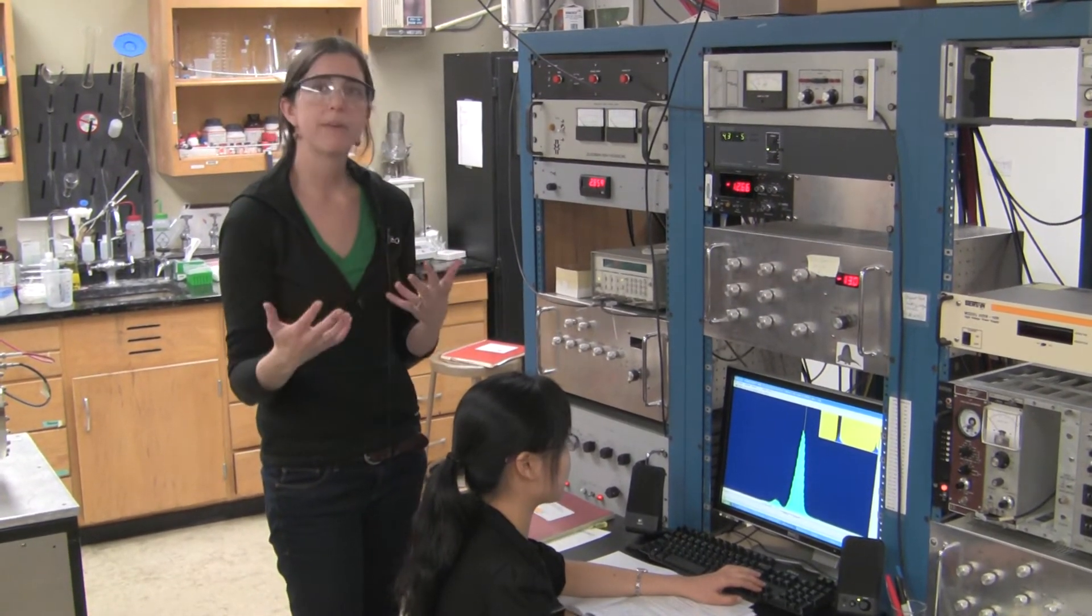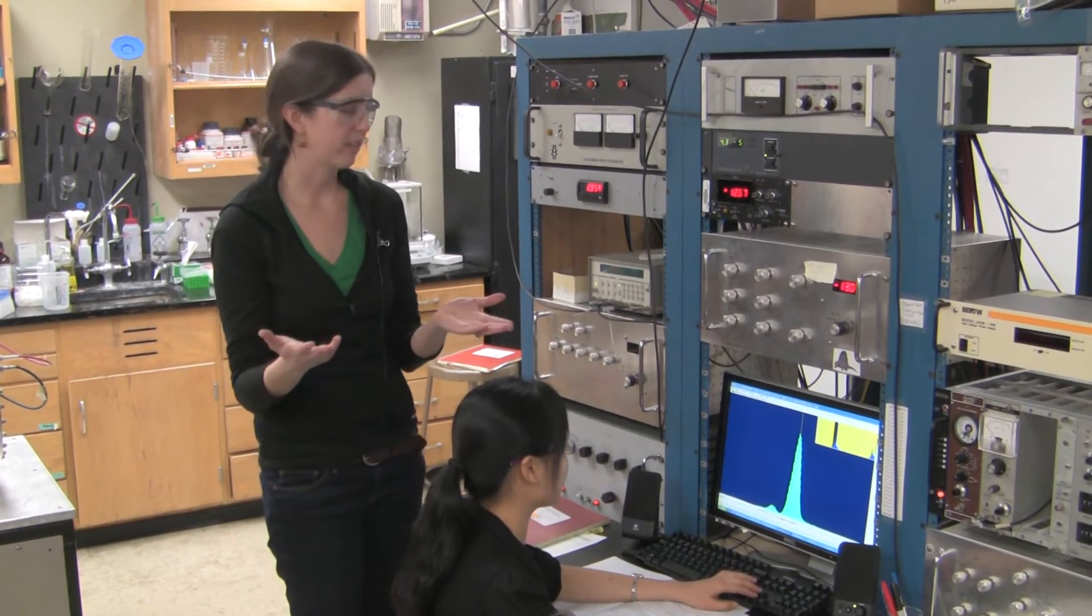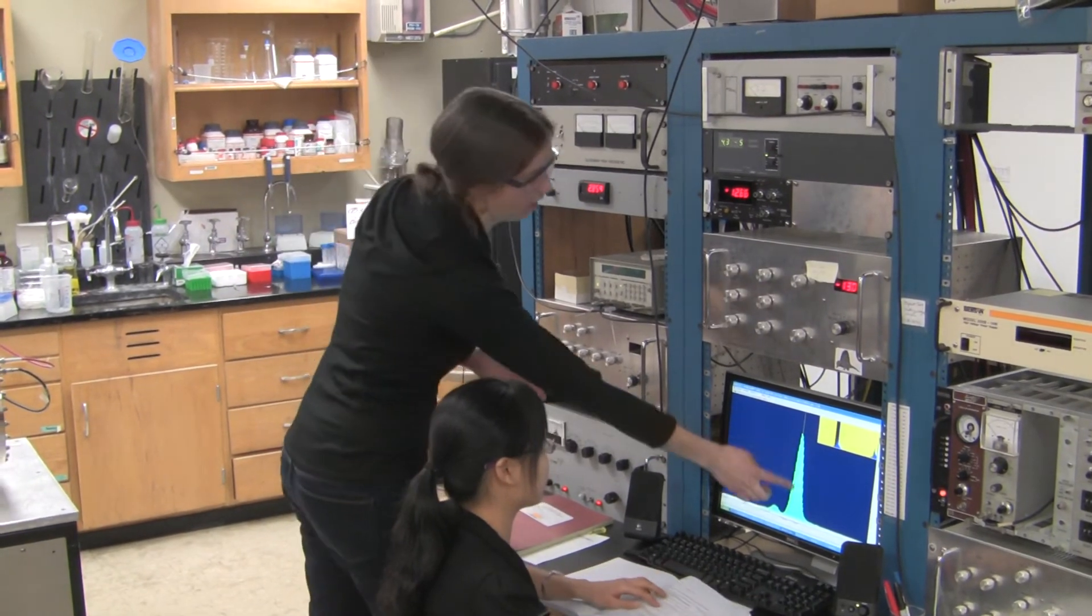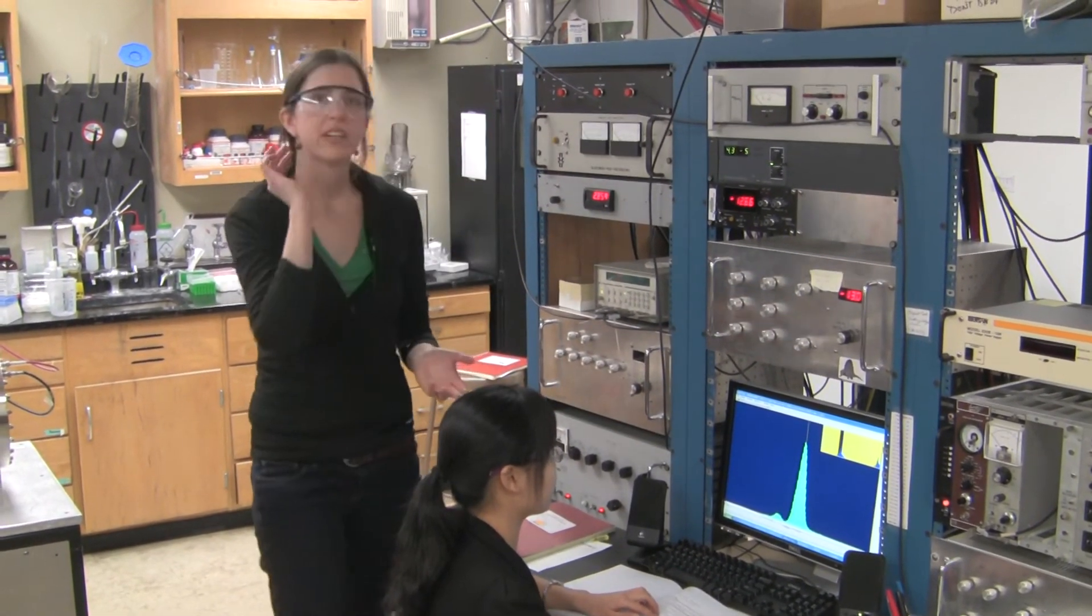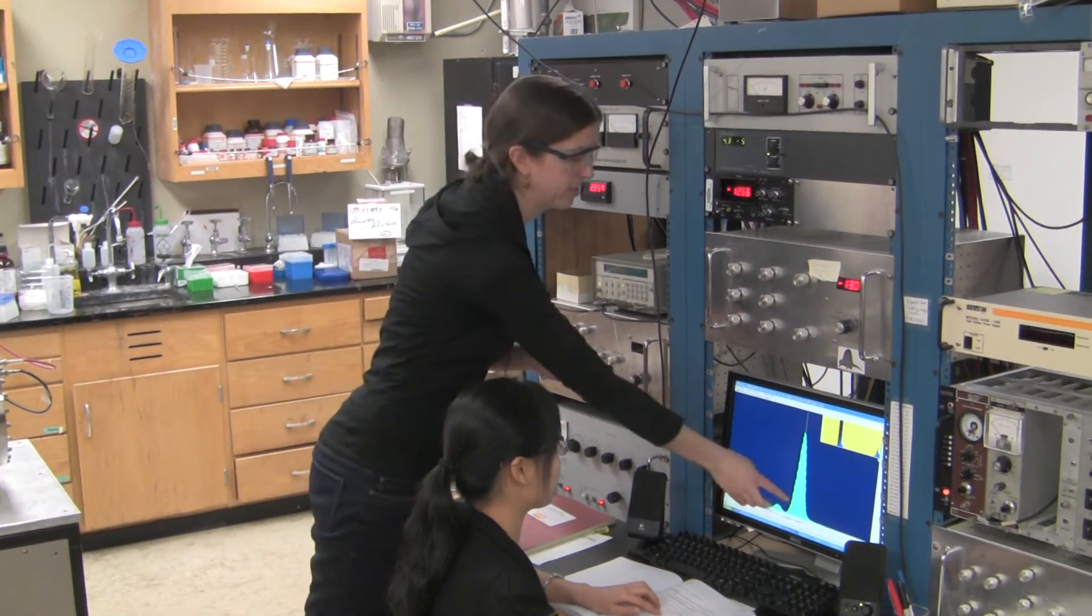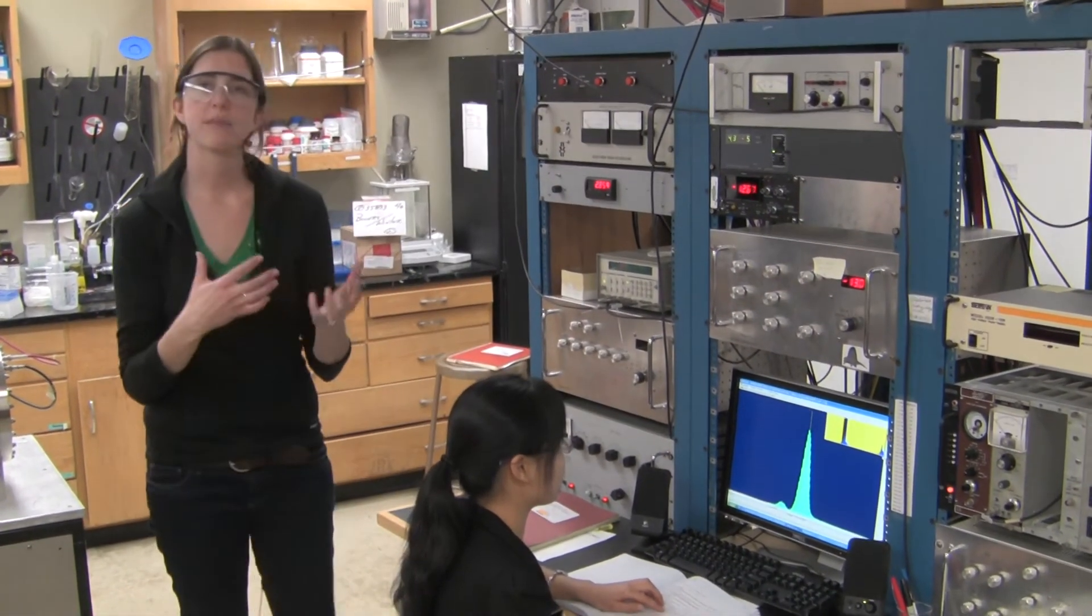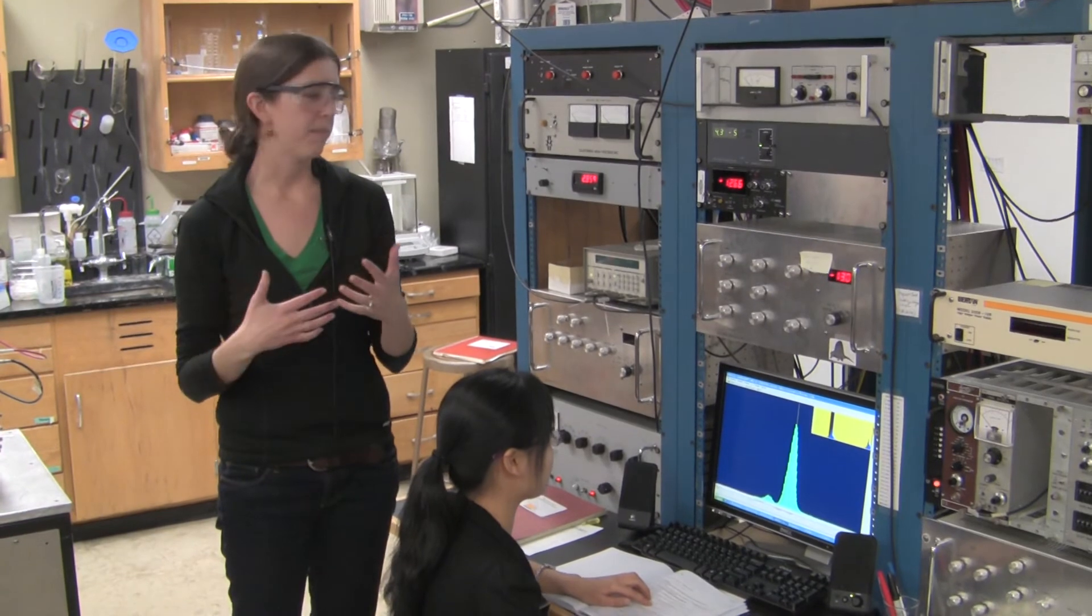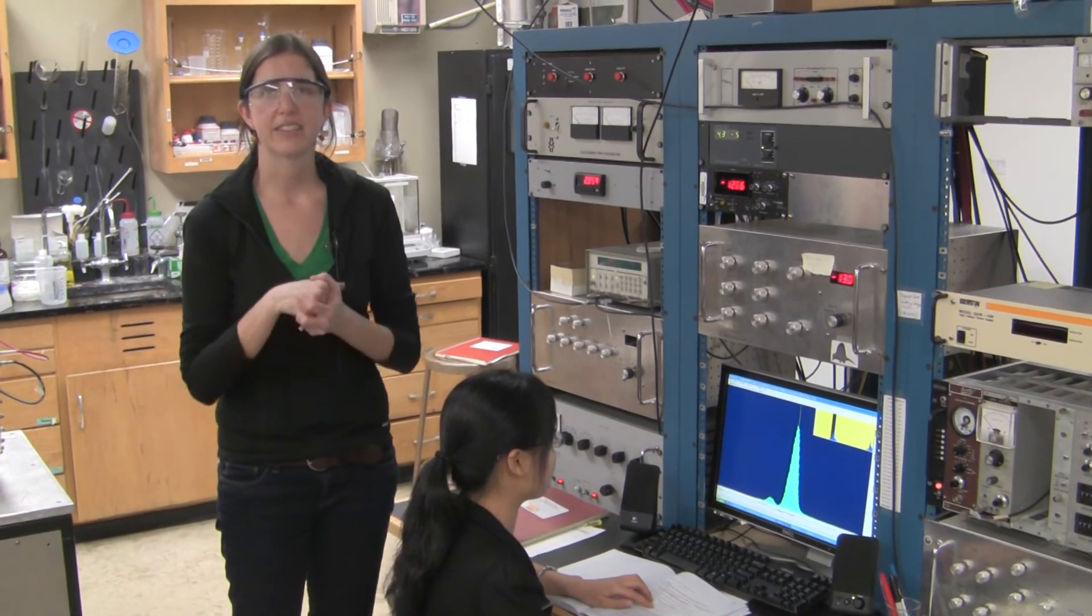But with ion mobility we can separate these aggregates by their size, and you can see we have one large population of smaller aggregates and a smaller population of large aggregates. And this really helps us identify what's going on in terms of the molecular mechanism of Alzheimer's disease.